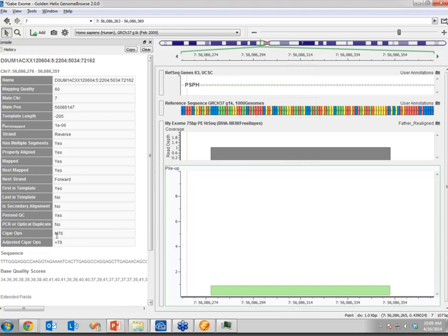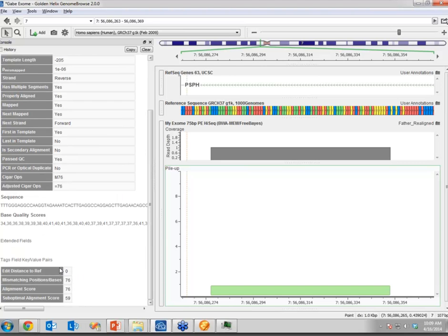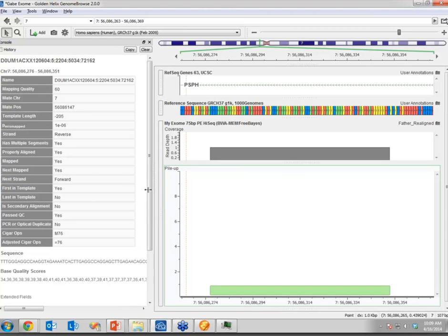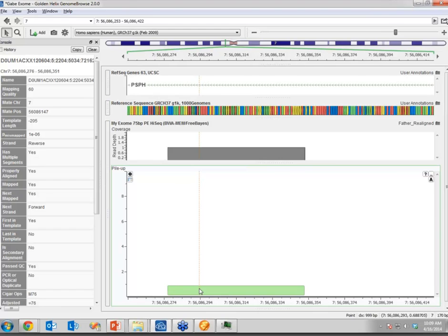to the human reference. So we're actually going to touch on, for example, what a CIGAR op means and some of these other things that look like useful information here. There's per-base quality scores, etc. So we're going to touch on those.